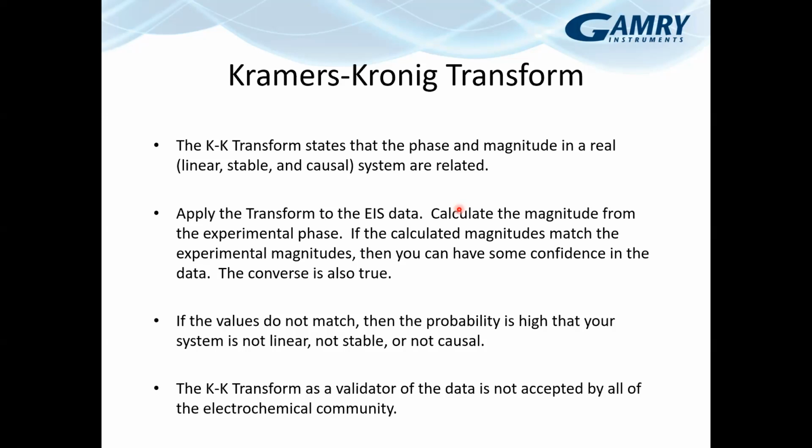It has a capacitance. If you are measuring capacitors that are very, very small, that cable capacitance can be a significant contributor to your impedance. But a capacitor is a valid circuit element. So if you do a KK transform and you've got instrumentation artifacts from the cell cable, for example, that are dominating your impedance, the KK transform is going to look perfectly good.